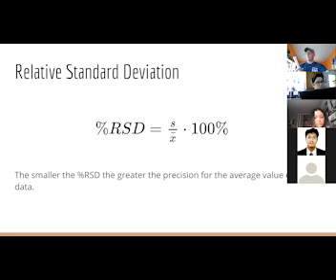And I'll explain why that is, because this is 50 mils, and when you look at it, you can see that there are tick marks for 49, 48, 47, and so on. Right on the top of the graduated cylinder, it says 50. You won't be able to see it. It says 50 and then colon 1.0. What that means is each one of these marks is 1.0 or 1/50th of the total. Now, if we look at the 10 milliliter graduated cylinder, on the top of it, it says 10 colon 0.2.